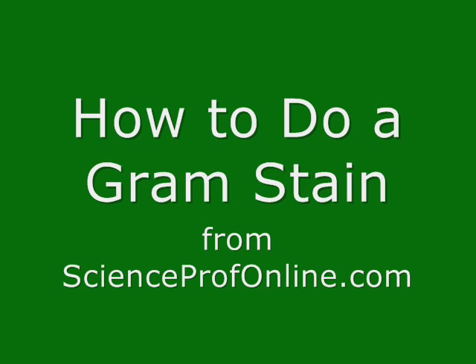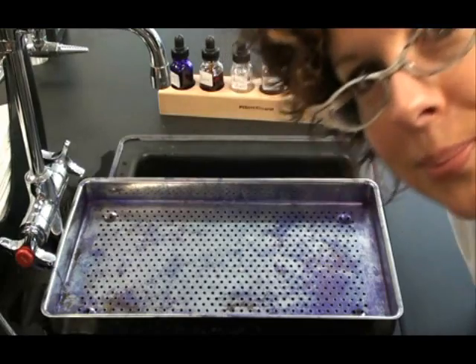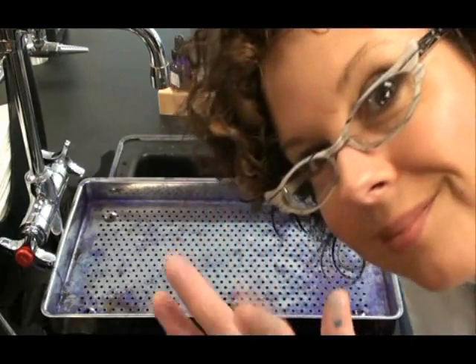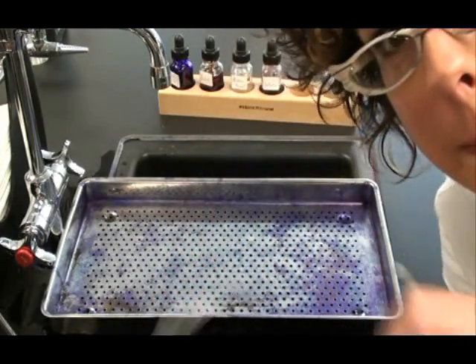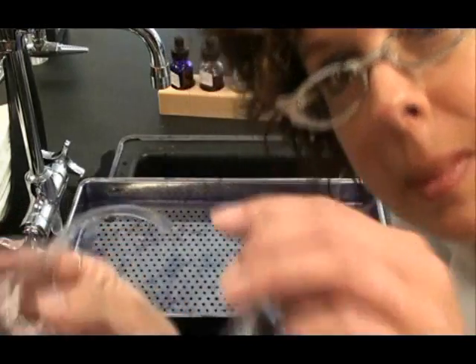In this video, I'm going to show you how to do a Gram stain. Hello! First, we need to put on eye protection.